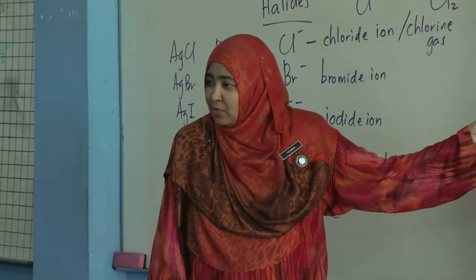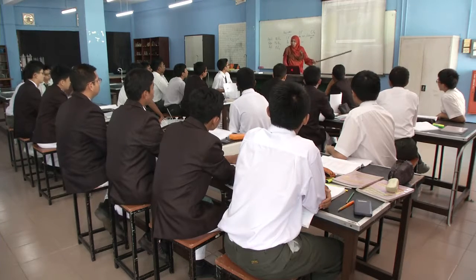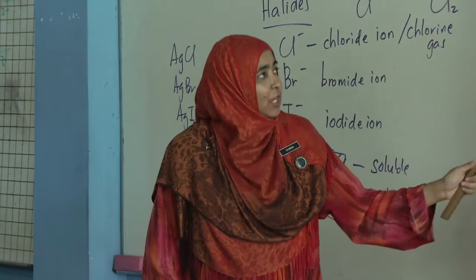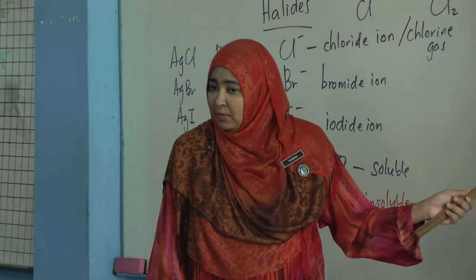What is the function of the glass rod? Is it to stir? No. You stir before. Now you're using it to avoid spillage. Because we don't want the salt content or the salt solution to spill out from the filter funnel. Until here clear? Yes.